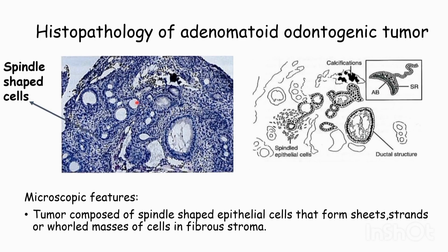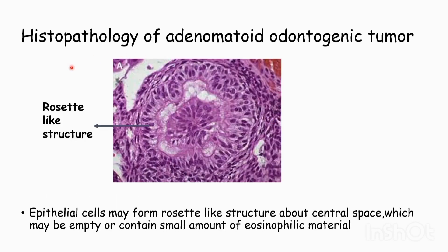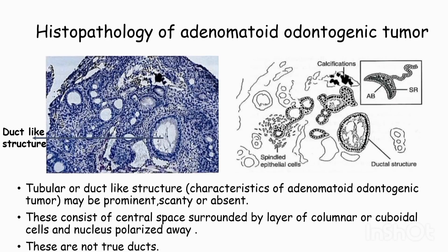These tumors contain spindle-shaped epithelial cells that may be in the form of sheets, strands, or rolled masses of cells in a fibrous stroma. Epithelial cells may form rosette-like structures where the central portion may be empty or show some eosinophilic material.